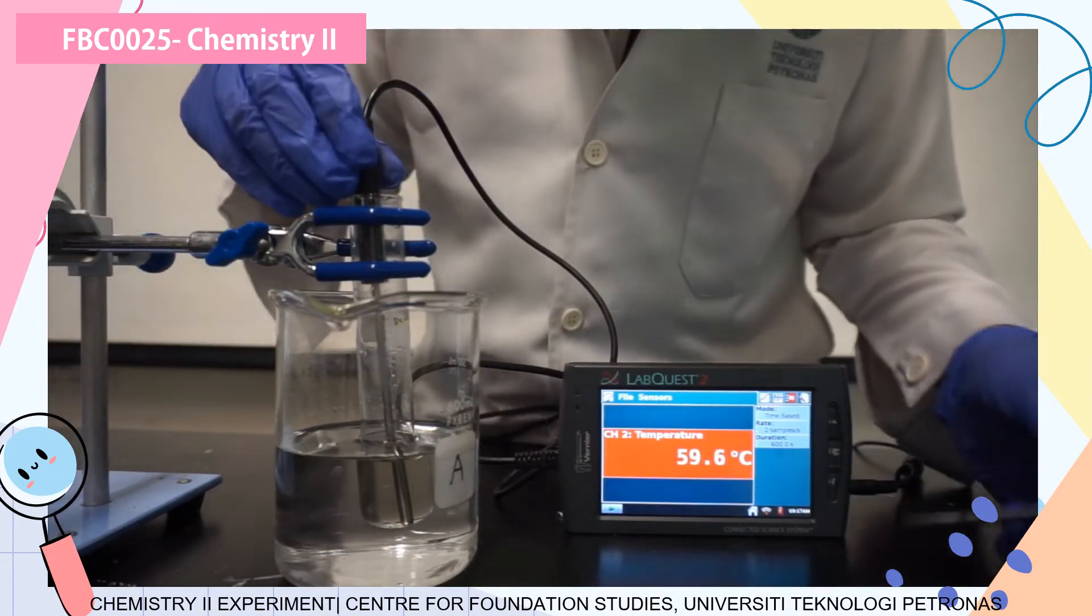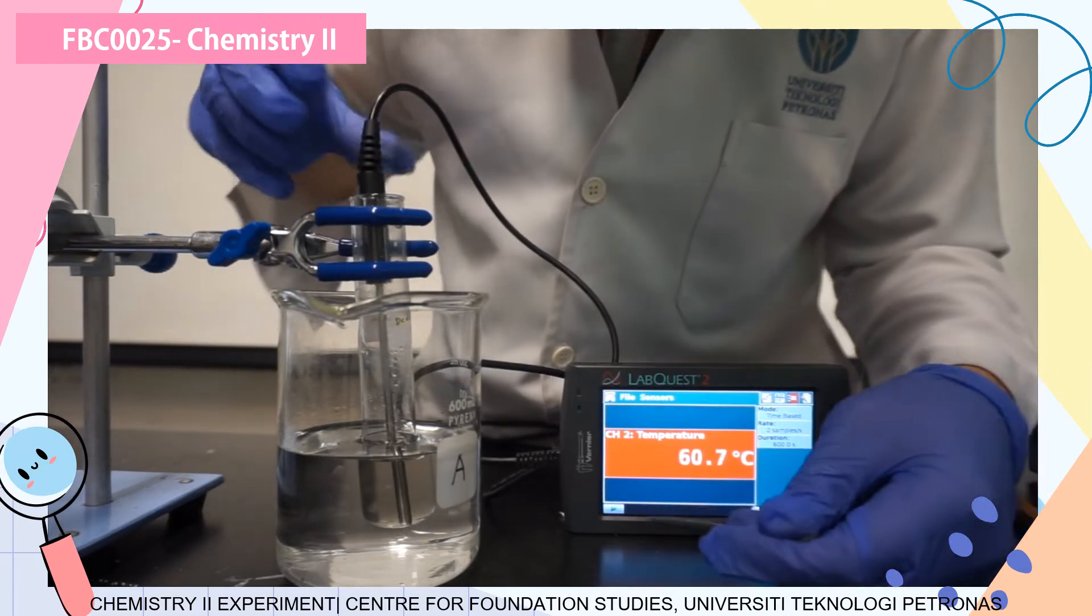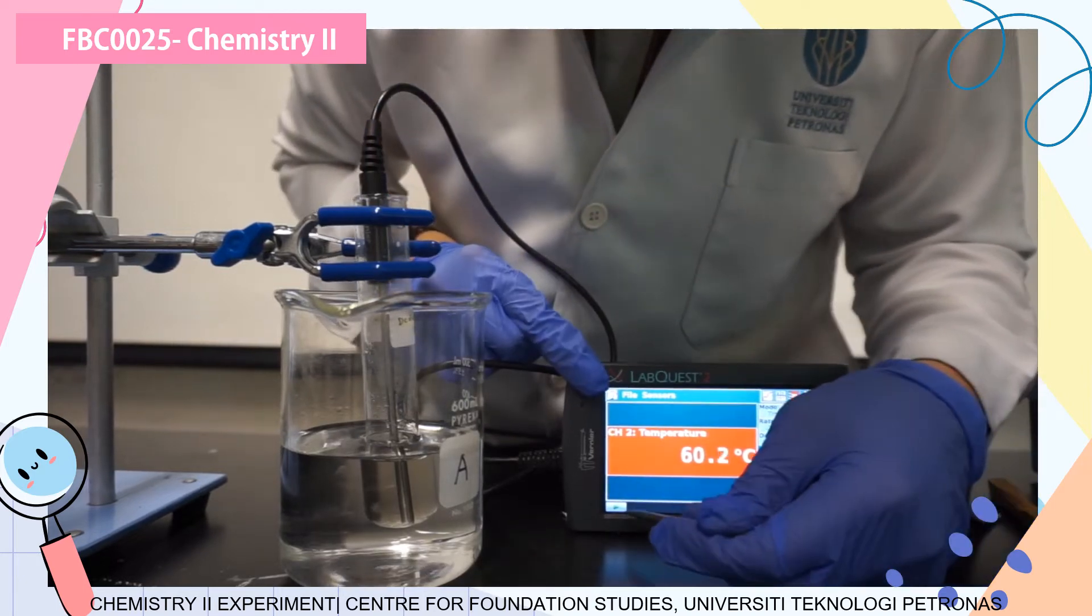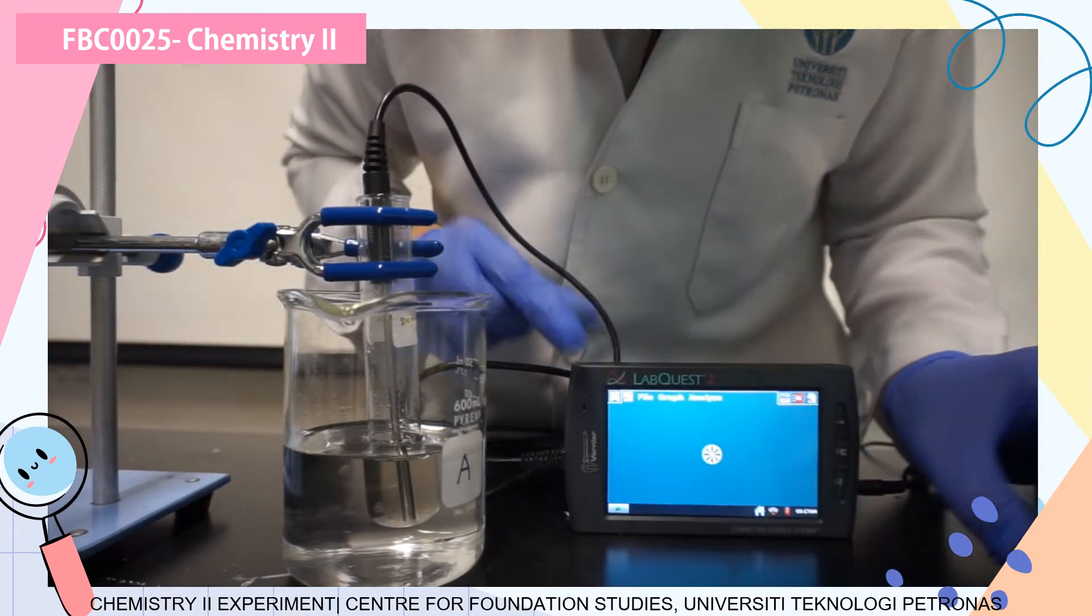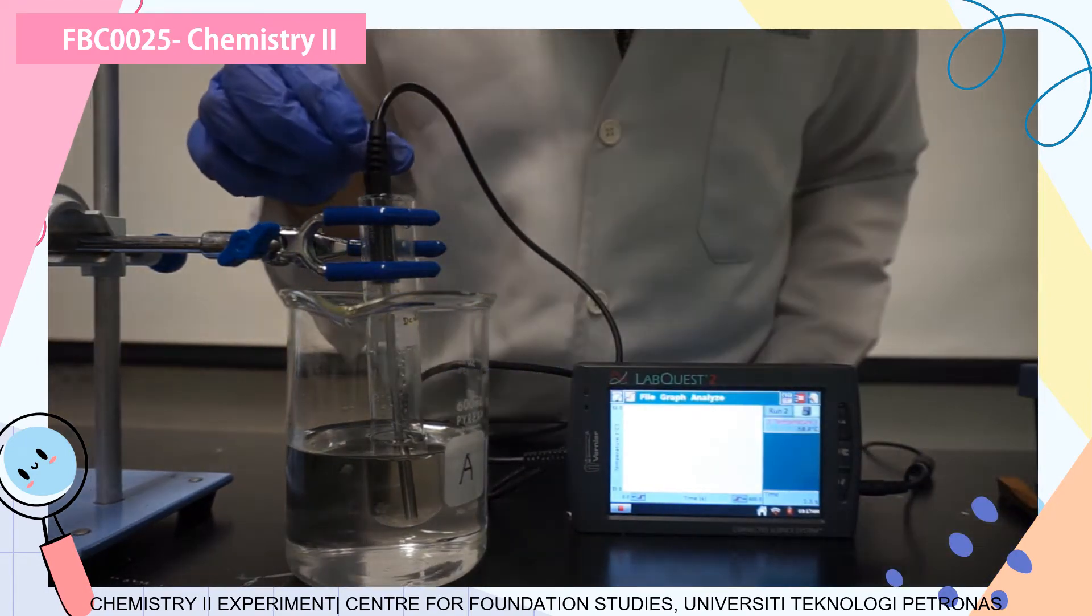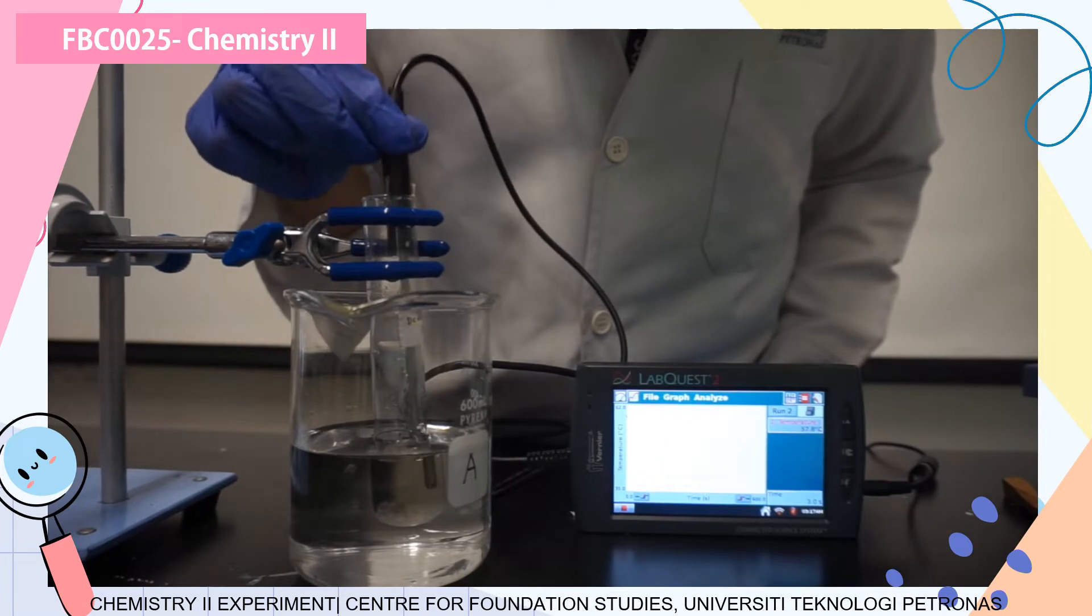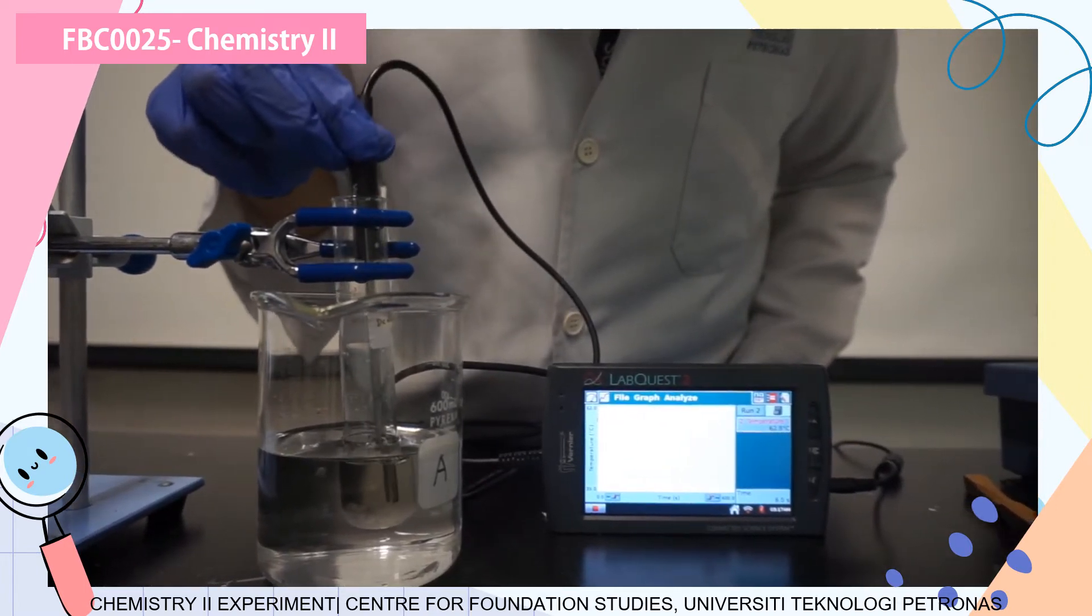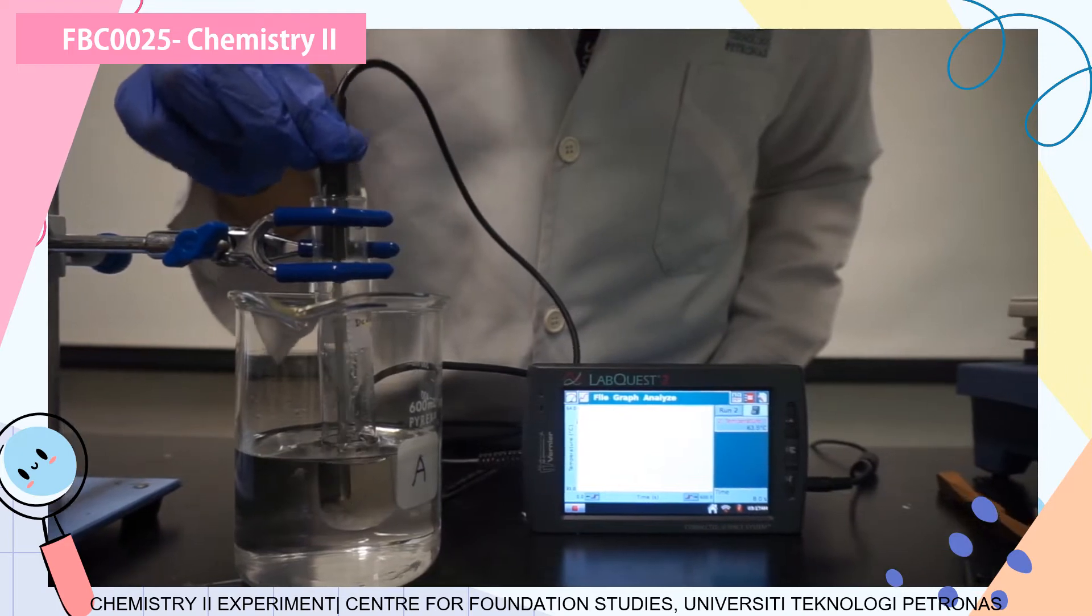After that, you are going to have your LabQuest here and put it in. Can you see? There is a temperature reading. It should be working. Once it reaches a certain temperature as given in the lab manual, you can click start. Once you click start, that means the data is being collected by the LabQuest.